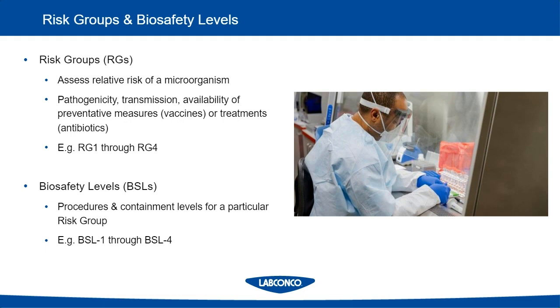For instance, in a BSL 2 lab, you might be required to wear safety glasses, lab coat, and gloves, whereas in a BSL 3, you might get into a mask, full face protection, and so on and so forth. BSL 4 labs often require a full positive pressure suit to protect you from the agent, as well as the biosafety cabinet and the other standards.